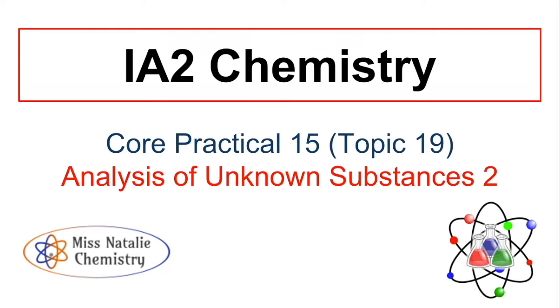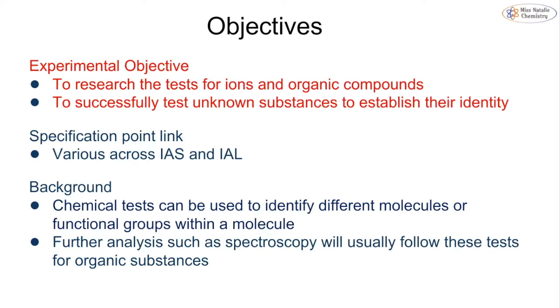but of course it can tie in with all of our inorganic tests that we've looked at in this entire course. So the experimental objective is to research the tests for ions and organic compounds and be able to successfully test these unknown substances to establish their identity.